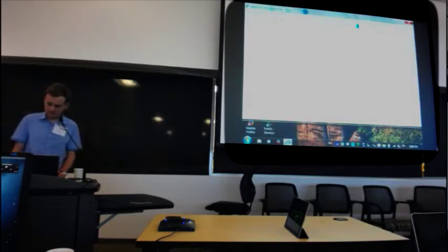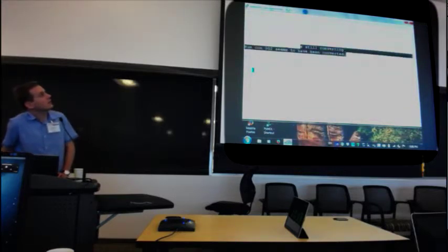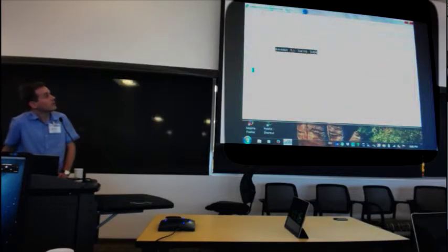Okay, so let's try. And it says that the run number 002 is still converting. Oh, it says that it has been converted, or seems to have been converted. And now it is submitting the indexing job to, no, sorry, I haven't changed it. It says this one, but it has submitted it to this one.